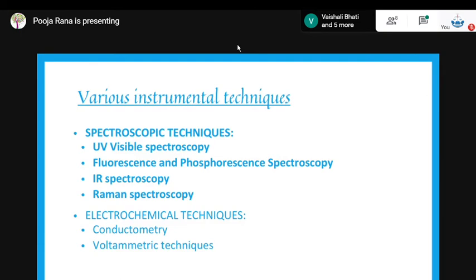All right, now next is fluorescence and phosphorescence spectroscopy. When I'm talking about these techniques, I am not specifically focusing on explaining the instrumentation right now, because that would be explained to you eventually. Here I'm just briefing you on what these spectroscopic techniques are.